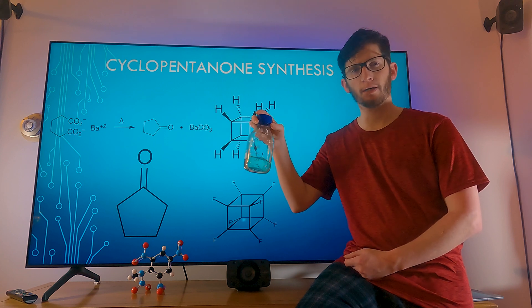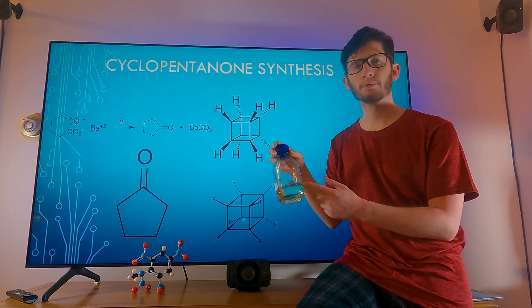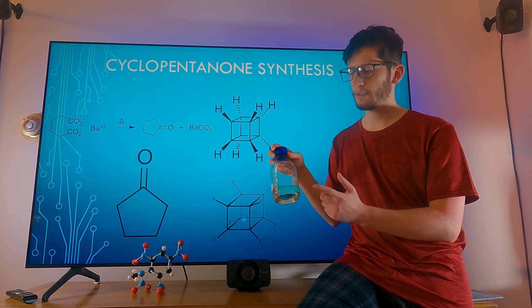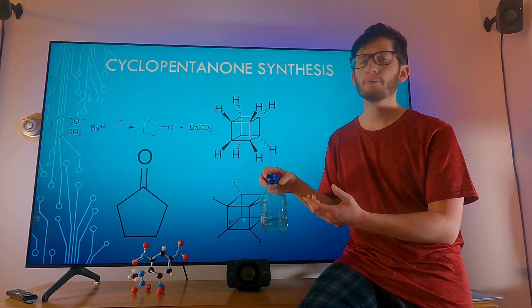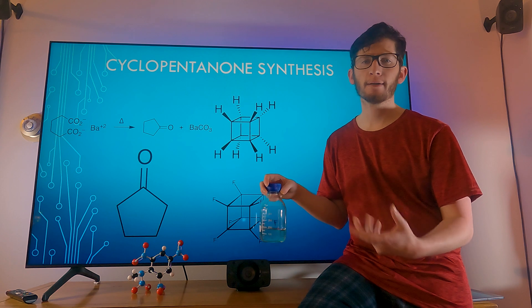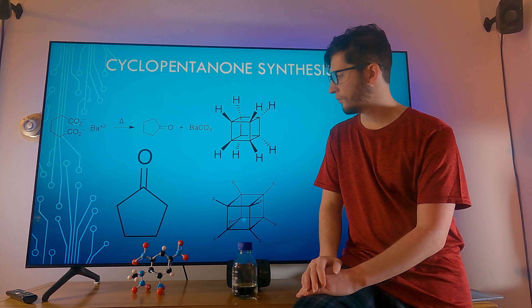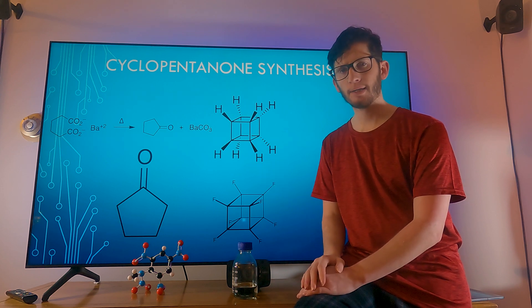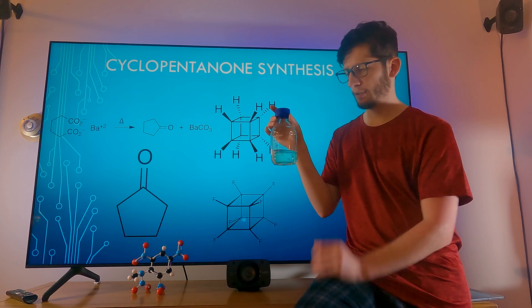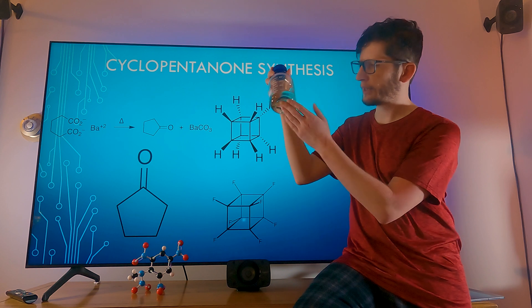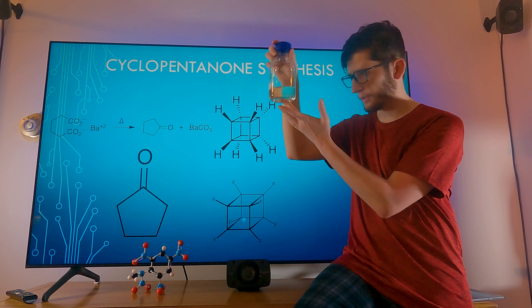We are done here and I've got about 180 milliliters of crude cyclopentanone. We're going to need to salt this out to get rid of the adipic acid. We're going to do that with potassium hydroxide probably, and then we will separate it in a funnel and redistill it. I'm going to do that closer to when I'm doing my next step, so I have a few things to do before this. I'm actually going to do another distillation and hopefully get double this.